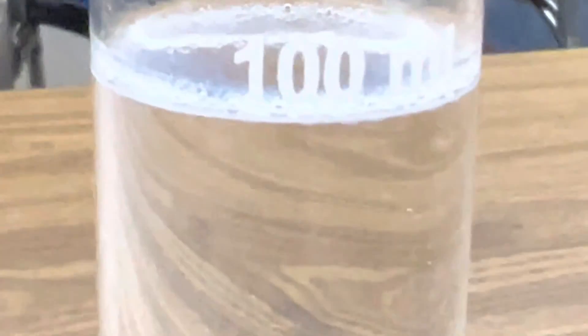Now we're ready for the reaction. This is a double displacement reaction, and as we add that ferrous sulfate to the sodium hydroxide, you'll see the precipitation of ferrous hydroxide.